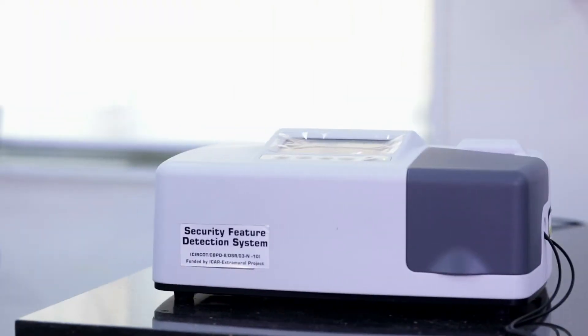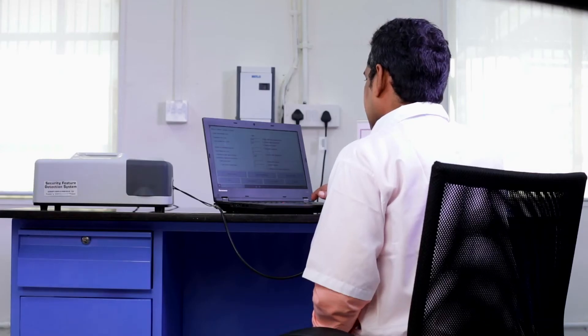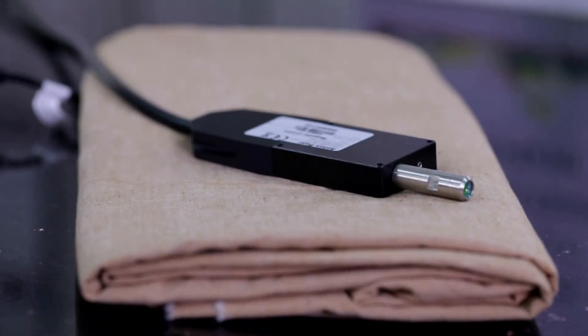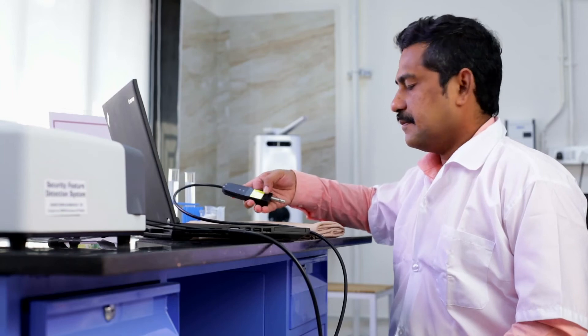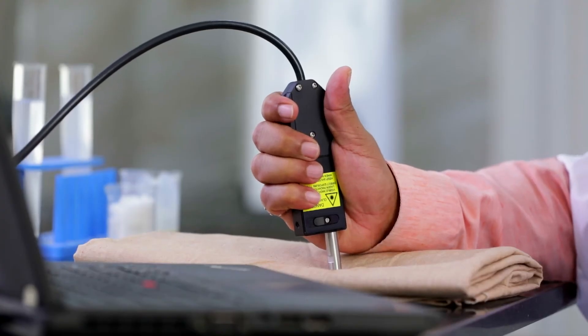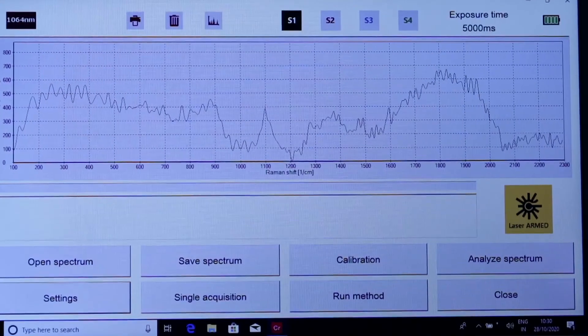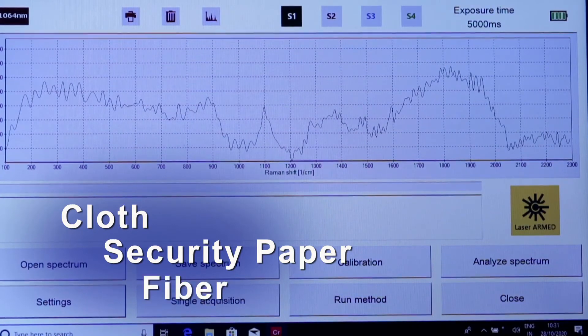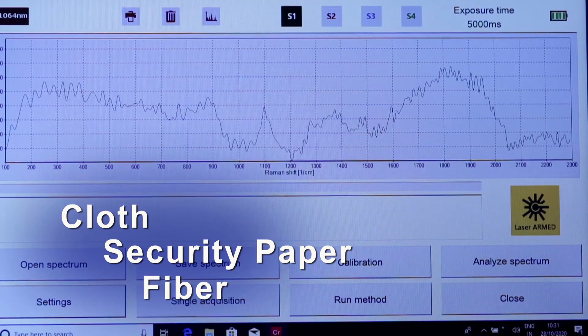This instrument is working on the principle of collecting scattered light after laser excitation of the sample and confirms the identity of different compounds. It is used in the qualitative and quantitative analysis of substances in trace amounts on different matrices such as cloth, security paper, fiber, etc., without extensive sample preparation in a non-destructive manner.